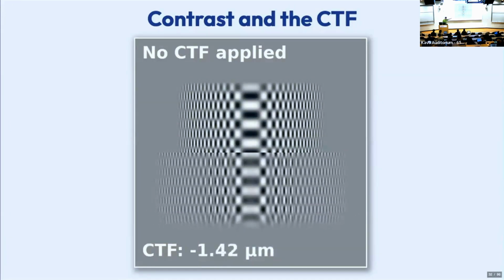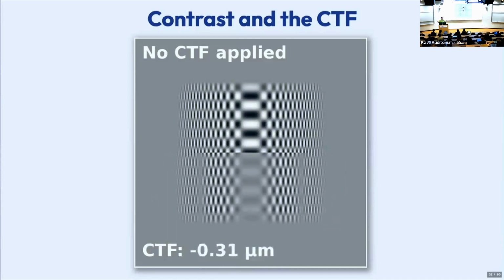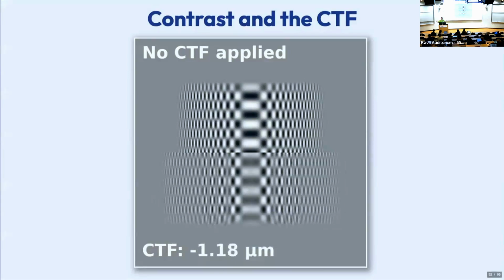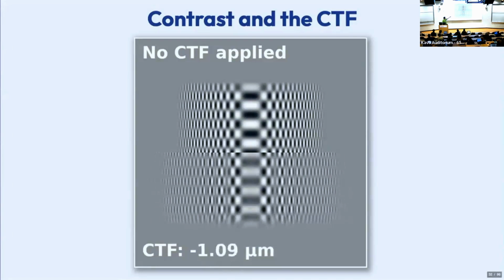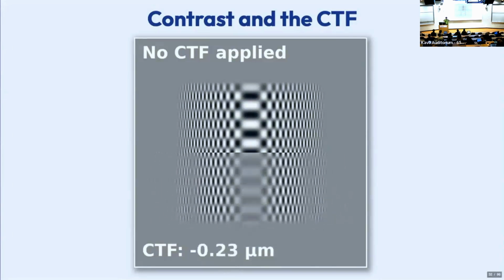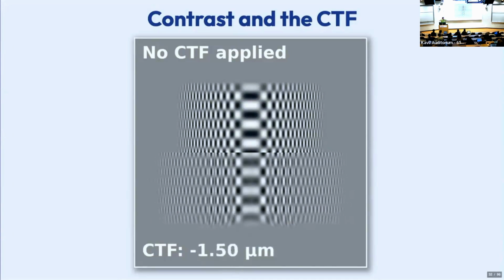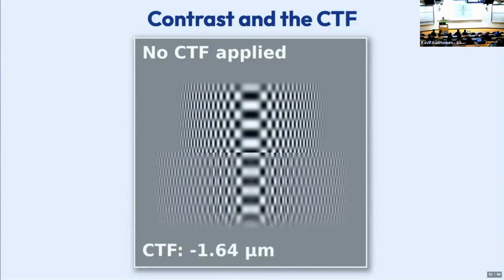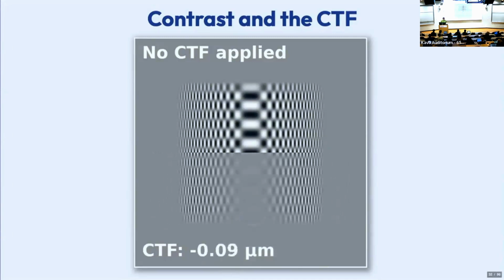This particle is not changing at all, but the defocus moves that high frequency signal outside the physical bounds of the particle, okay? This is a really important concept because if you just extracted a particle image that only contained exactly the real physical size of the particle, all that high resolution information that got pushed out of the image would be lost. And so that's why we extract with a bigger box. We'll talk about extraction in a second.